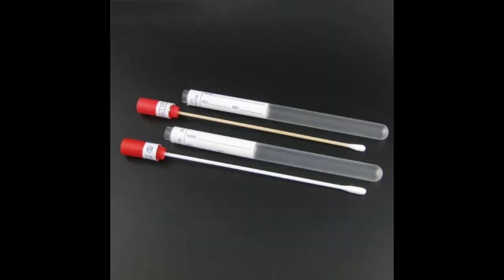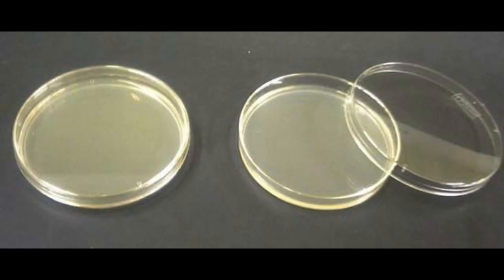So coming back to the topic, now let's say you have taken the samples. The sample taken must be sterile. You can use a cotton bud to take a sample, for example. That swab must be sterile. Now how will you obtain bacteria? First of all, you need to learn about agar.